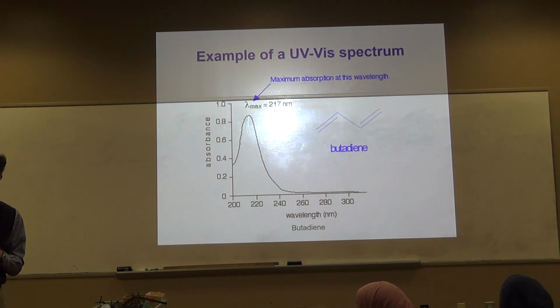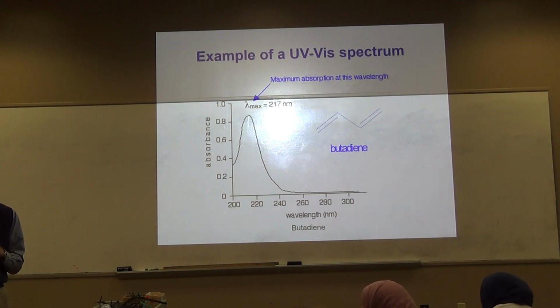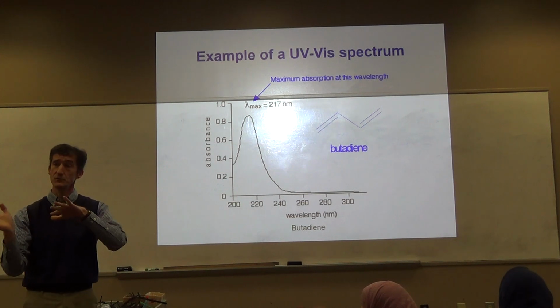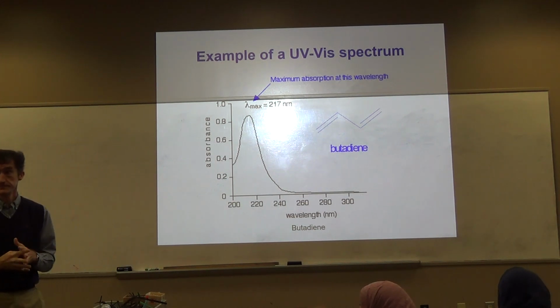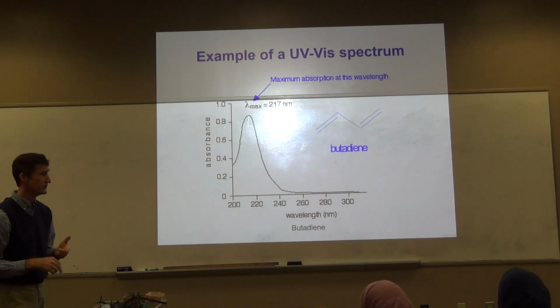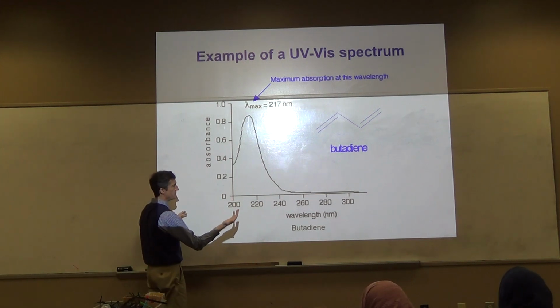But when we do a background, we eliminate that. It gives a spectrum of air, but it cancels that out from your spectrum. So when you do your spectrum of your compound, you don't get any peaks for oxygen, nitrogen, CO2. I'm not sure why you can't just do that here.